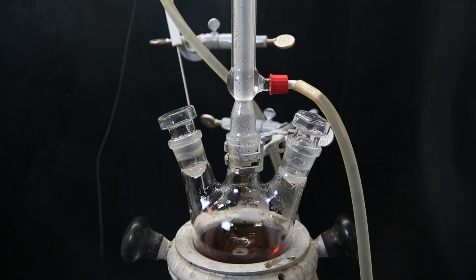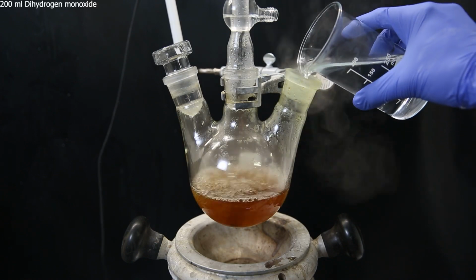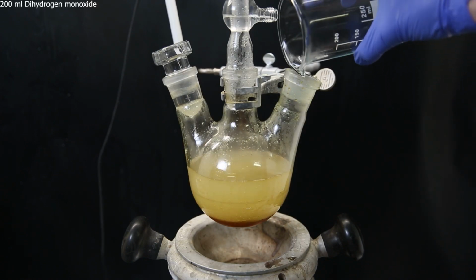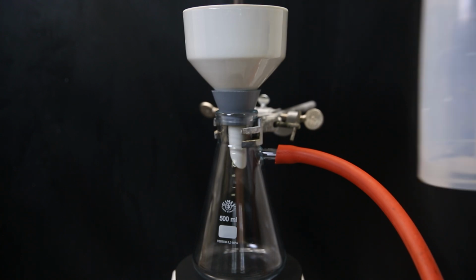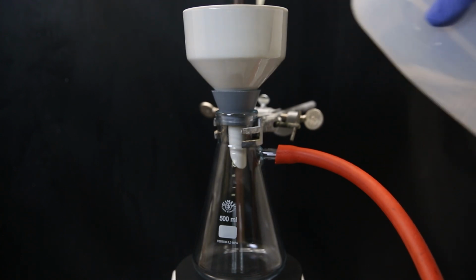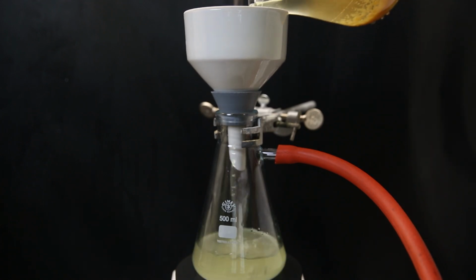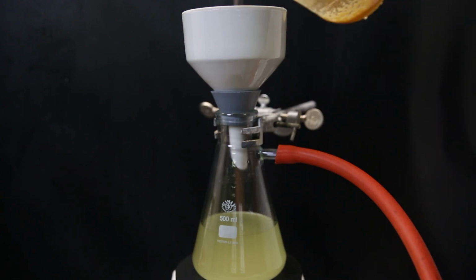When I come back the next day, the mixture has become a dark amber color, and the reaction should be finished. I then take it off heat and add 200 ml of water to separate out the product. The product is the layer on the bottom, and I leave it to cool down to room temperature so that it solidifies. When it has solidified, I set it up for vacuum filtration and wet the paper filter with some water. I filter all of the liquid through and wash it with some water to get out all of the starting material and pyridine salts.